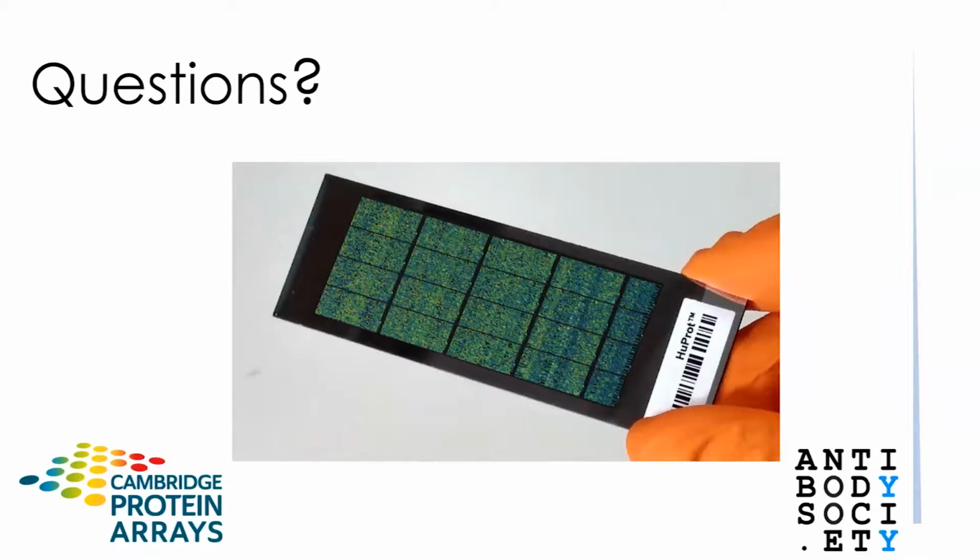Thank you, Mike. I guess whatever the technology we use, we're always concerned about how realistic the target molecules are compared to what we find in the experimental context. It's a beautiful technology you describe, and I know you mentioned these issues in your talk, but would you like to comment on how you assess whether the protein arrays, the proteins on the arrays are folded in a native conformation? Well, thank you for that question.